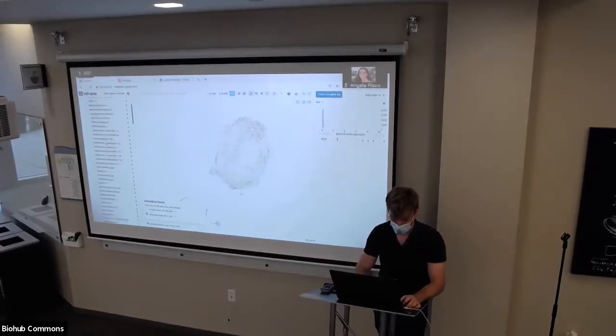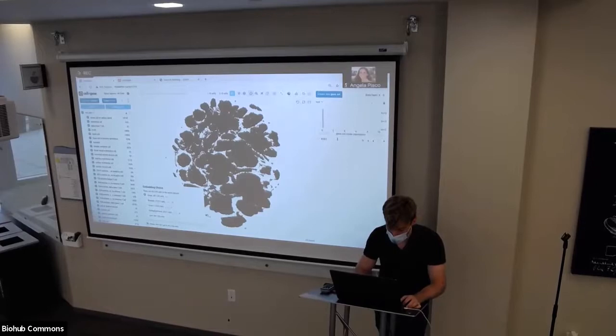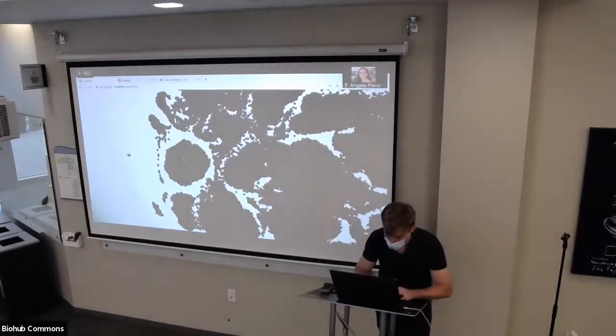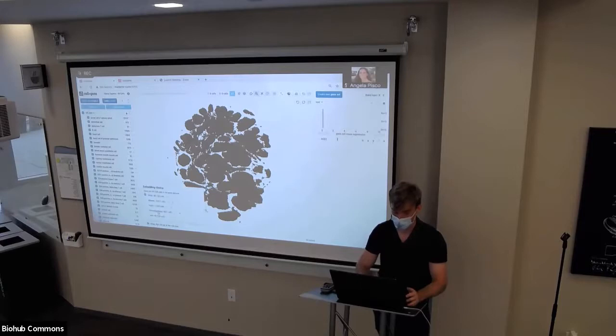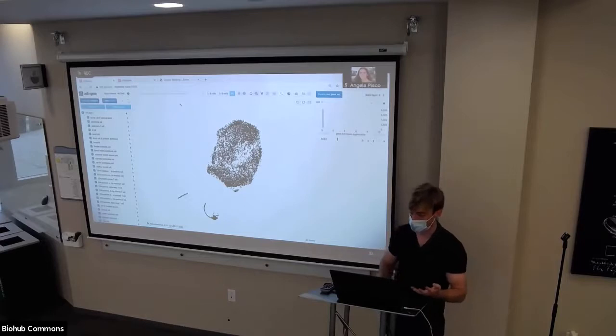So we're going to click on kidney epithelial, and here I'm going to just remove the selection state. If we go on the top and look at this cluster here, and try to zoom in on it using this zoom tool, you see that it's kind of like a blob, right? You can't really tell, are there any clusters in there? And the labels we have just call it kidney epithelial. But now when we go into the kidney epithelial subclustering view, oh my gosh, there are like four subtypes.